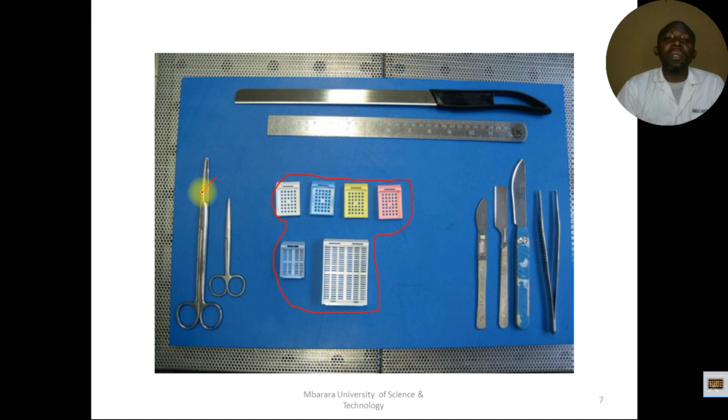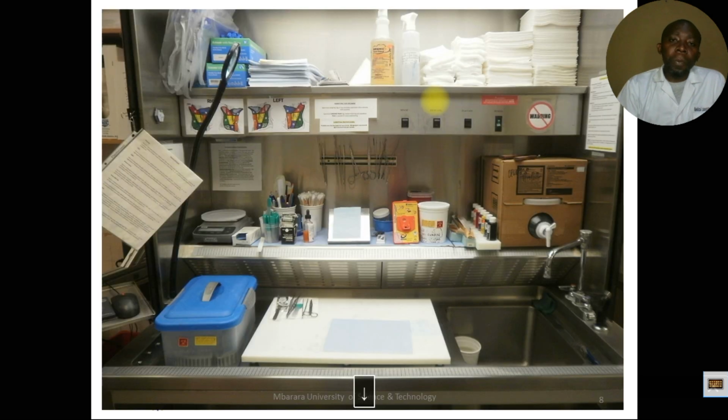So we have scissors of different types, and then we have blades here, we have the scalpels here, we have forceps which we use for picking out samples, we have a ruler in millimeters which is used for measuring the length of our specimen or samples, and then we have a knife because we need to cut out some pieces or cut open some tissues. Like the example I was giving about a breast, we need to open it up, and we can use a knife to do bread loafing.